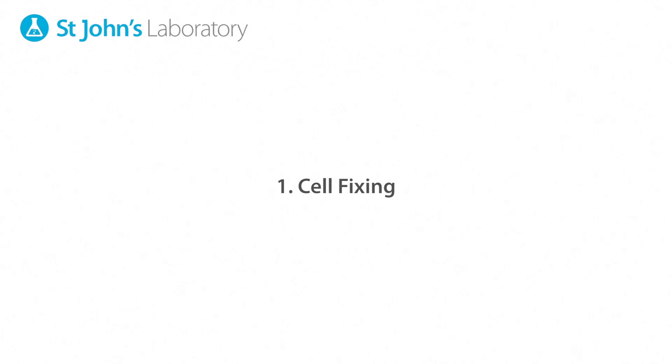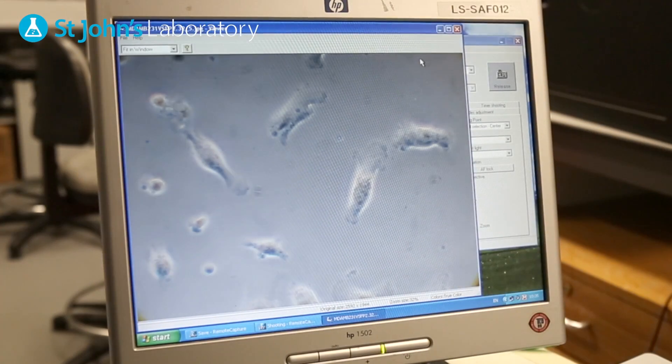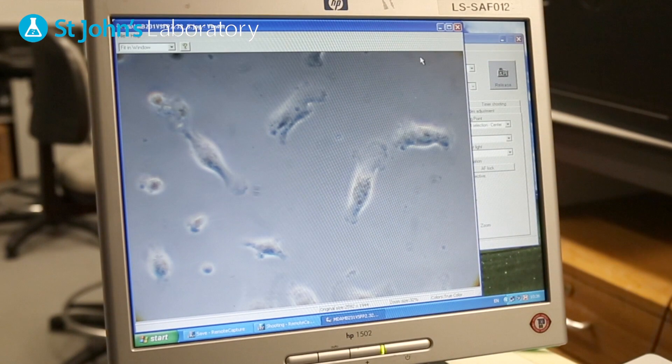After growing your cells in the laboratory you will need to fix them prior to any antibody application. It is important to be aware of the monolayer structure both before and after this process is carried out.